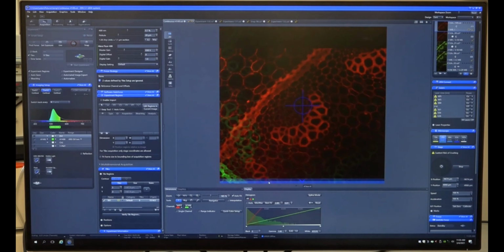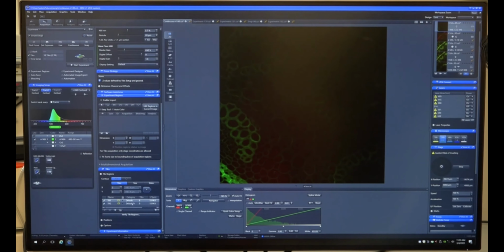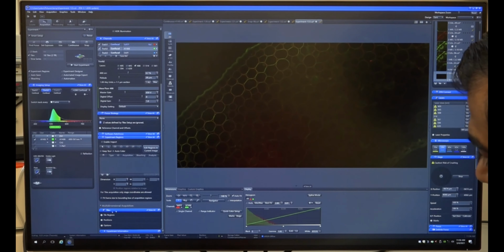So it's altogether a different plane or different field of view, rather, not plane, but field of view. And then I've selected this region, suppose, and I say plus. So these two are separate. You see X and Y, Z is same.